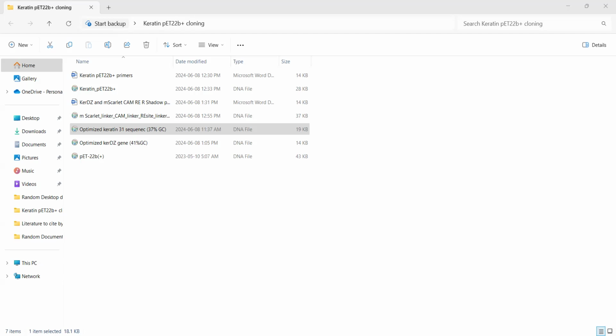It does. Reverse works. So now I'm checking this in my PET map. It works, beauty.